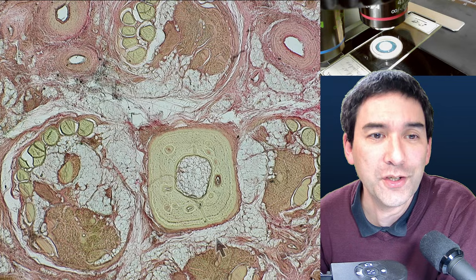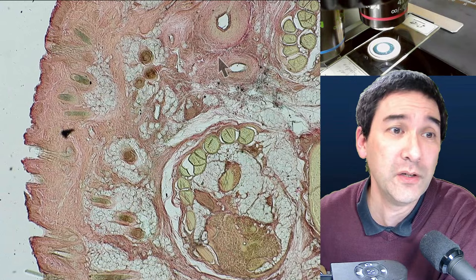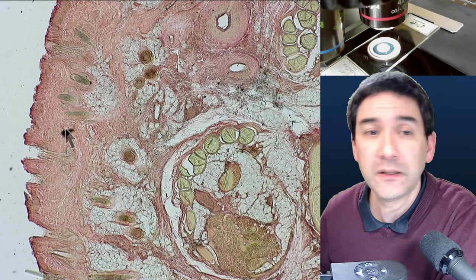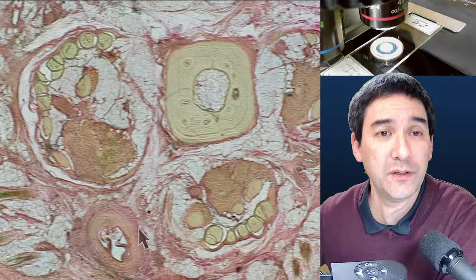Over here on the sides you can see hair follicles — that's the fur cut in cross-section. I know this because if you look at a cross-section of human skin, it looks exactly the same — these are diagonally cut hairs from the fur. I wanted to show this as one of the new additions to my collection. The four muscles are relevant for moving the tail in both directions.